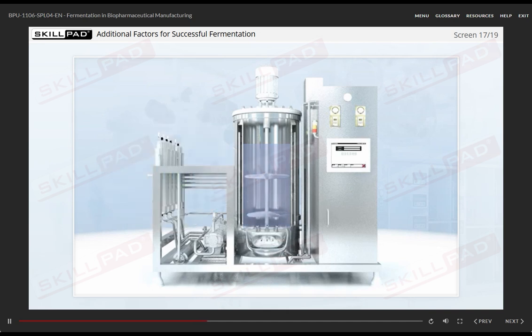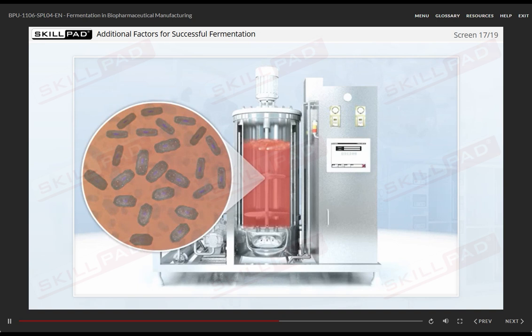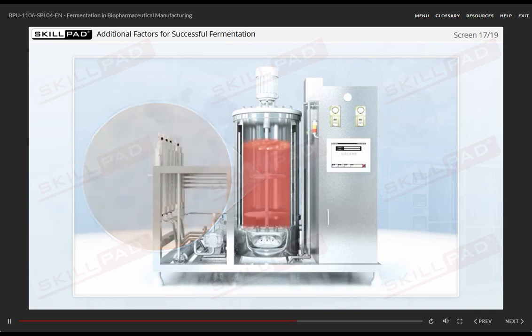The production of foam during microbial fermentation is a serious issue that must be addressed in the majority of fermentations. Foaming occurs due to the agitation of the medium and the addition of various components to it. The foam produced can damage the cells and cause fouling of the equipment. Foaming is prevented by adding chemical anti-foam agents and by using mechanical techniques.